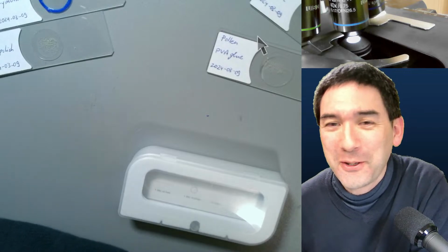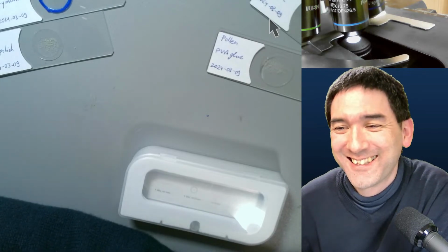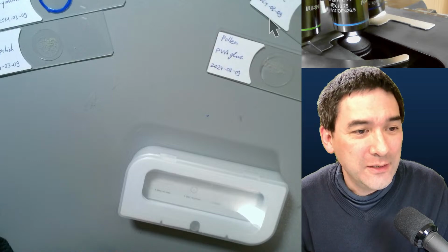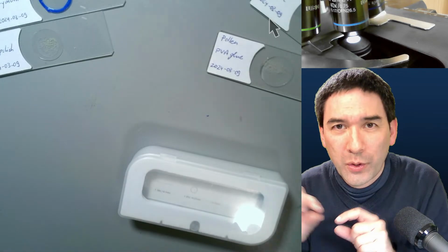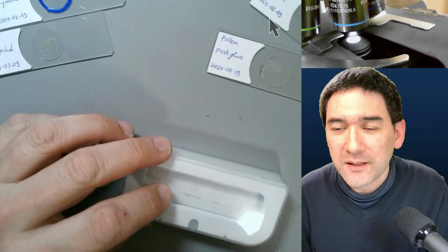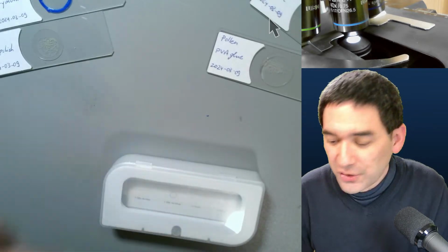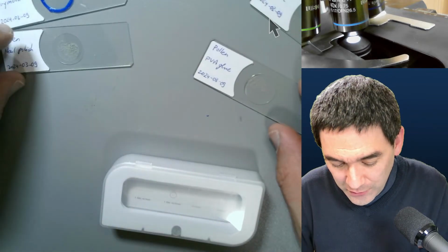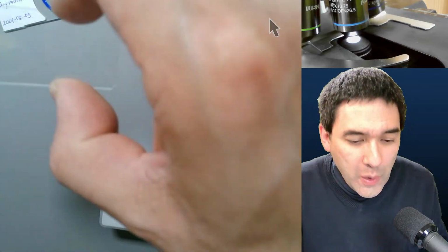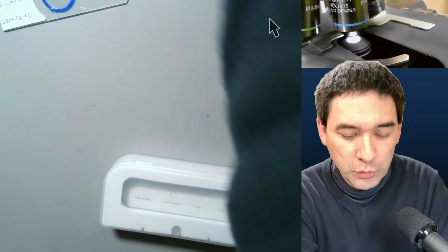I want my commission. Okay, that's a nice idea. As a matter of fact, I did already start to do something like this, working with scale bars. But I think that's certainly a good idea. So the next thing that I would like to do is carefully move those permanent mounts away because they might not be fully dry yet.